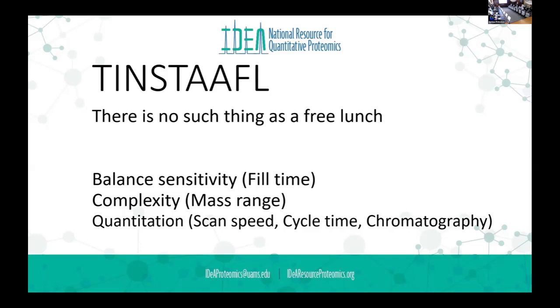And finally, with quantitation, you've got scan speed, cycle time, and chromatography that are all coming together. I described this last night as a four-dimensional yin-yang. Nobody in our lab knows what the optimal numbers are on any of these; it's a moving target. If your chromatography can only reach a certain peak capacity, you have to adjust your instrument accordingly, or vice versa. If your instrument can't scan fast enough or needs a wider window, you have to adjust your chromatography. Those are all moving targets.